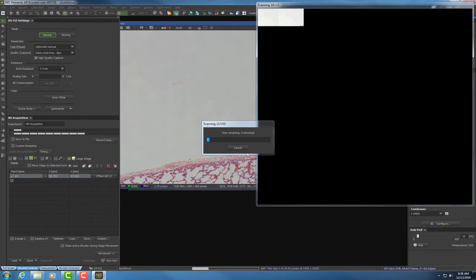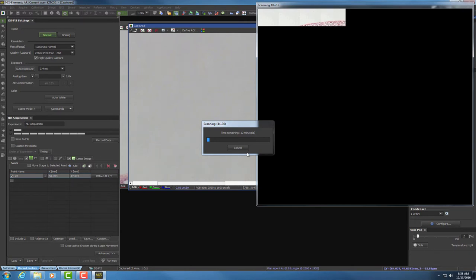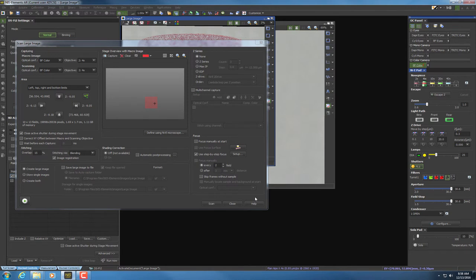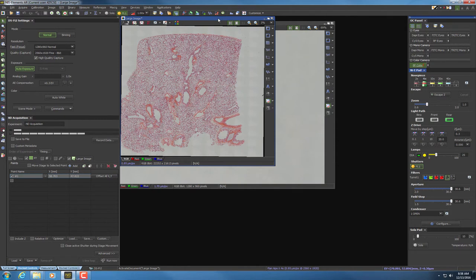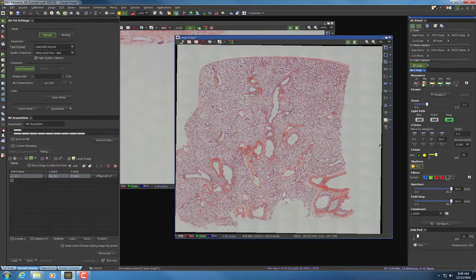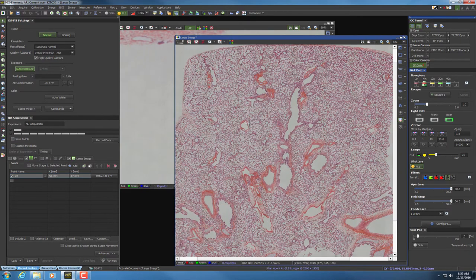The scan will take about 5 to 15 minutes to complete. Once it's done, hit Close. This is our tile scan — it's not a perfect tile scan because we missed some tissue on the left-hand side, but for this purpose it's fine. It's always good to have a little extra space, as it makes cropping in Photoshop easier. Let's look at the scan and see how it looks — zooming in with the scroll wheel, it looks pretty much in focus throughout the tissue.